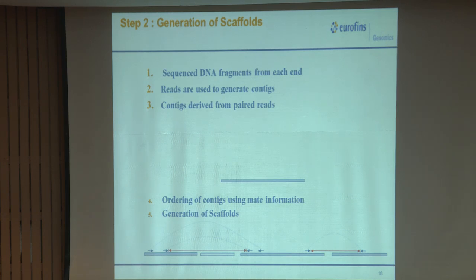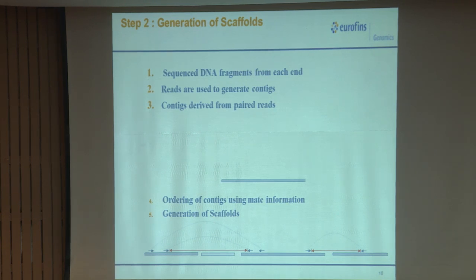You can use longer reads and insert sequence information which will fill it up. So, it's all a jugglery of the best and most productive softwares, as well as a jugglery of the different platforms. Right, exactly. A single one may not give you the complete picture. But for smaller genomes like bacteria, you can definitely go with a single platform, because the complexity is also less.